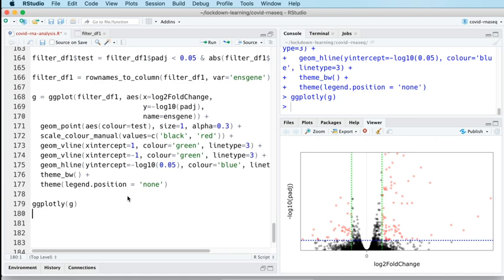And then, if we have time, we'll go from that to the third visualization, which I've alluded to but not really talked about in any detail yet, which is to produce a heat map from our differentially expressed genes, because everybody loves a heat map. So we will endeavour to do that either tomorrow or, more realistically, Thursday.